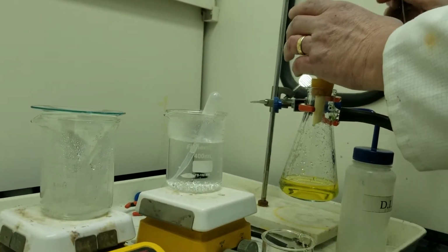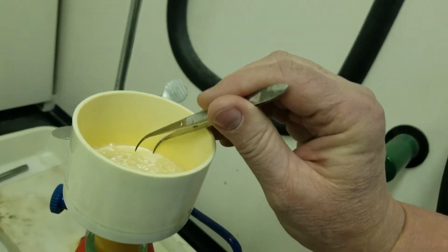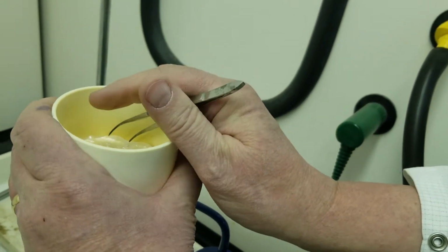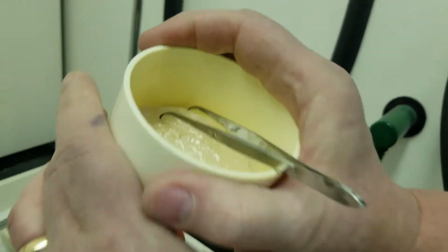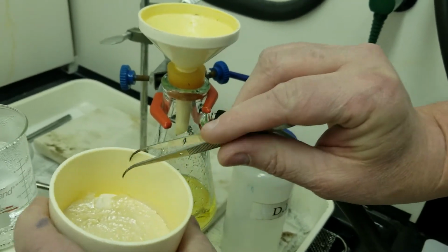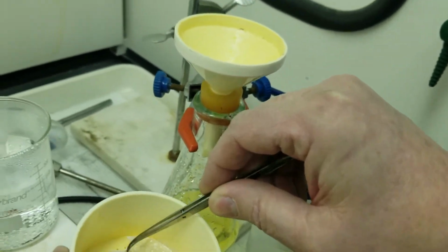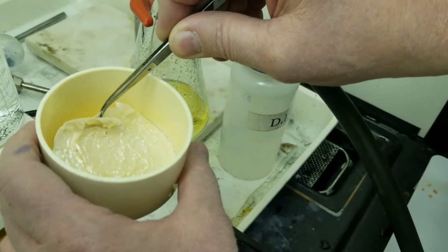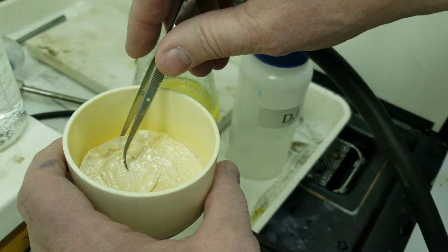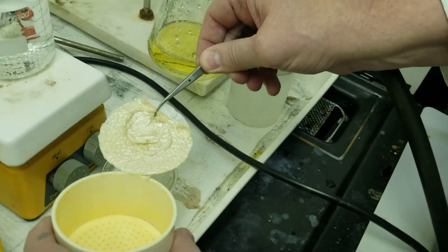Okay, so I'm going to transfer back in, and we're going to use boiling hot water. Boiling hot water will barely dissolve acetanilide, so it means it's an innocuous solvent. The problem is that boiling hot water has an incredibly high heat of vaporization and an incredibly high heat capacity. So it takes a while to boil and to evaporate, which will create a problem for us a little bit later on.